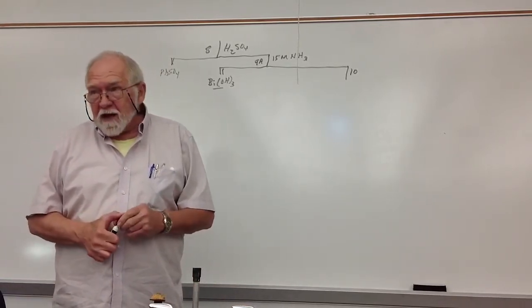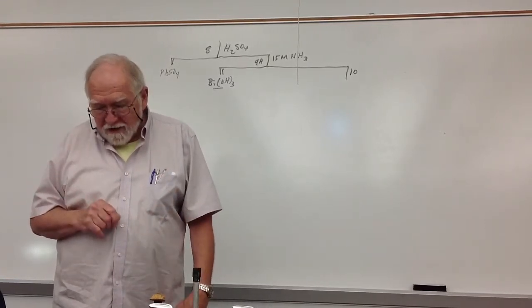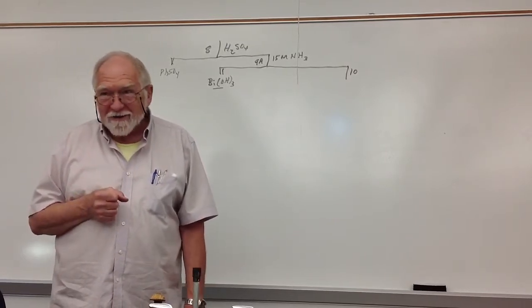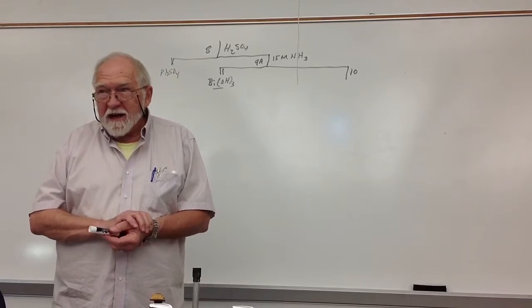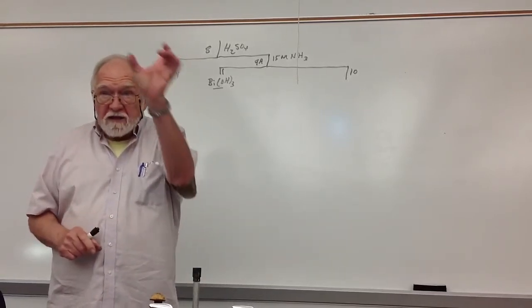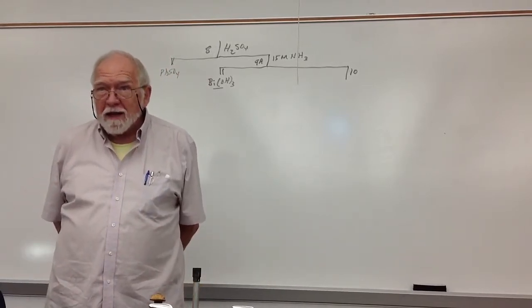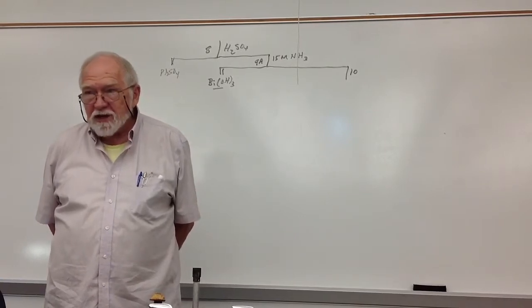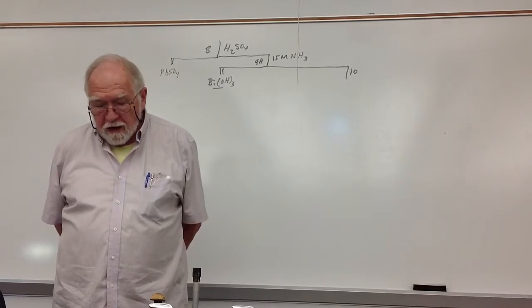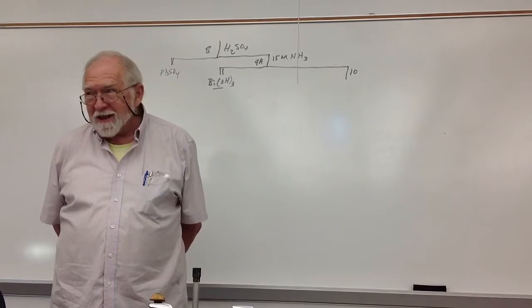People always wonder what the reagents are. First of all, those labels get obliterated. I try to write things on. I'm printing up new labels. I'll get some of those on, but they disappear in a week or 2 after people use it and dribble things down the side. So anytime you're in doubt, either ask me. And also I put lists of the different reagents, the acids and bases, on those backsplashes. So I put the concentration, the formula, the name. And with the exception of 3 molar nitric and 3 molar sulfuric, they all have different concentrations. So if you see the concentration, that matches.